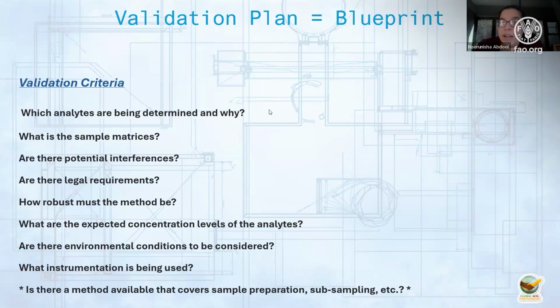So your fit for purpose statement is basically going to incorporate all of this and try and be, it's a fine line, as summarized as possible, but as detailed as possible as well. And then so that at the end, you can simply say this method is fit for purpose. To say, we are trying to determine calcium, magnesium, potassium, sodium, sulfur in sandy soils between the established working range, kind of thing.